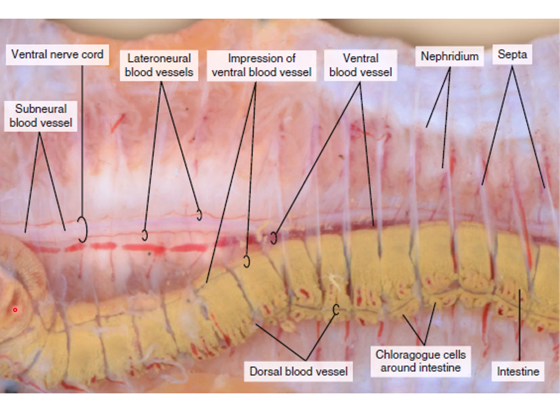The blood from the aortic arches, or the hearts, would enter into the ventral blood vessel, and from there the blood would enter into the capillary bed. Here we can see the capillary bed. The blood circulates in the body, and then comes into the dorsal blood vessel and re-enters the pseudo heart. So the dorsal blood vessel brings blood back towards the pseudo hearts, and the ventral blood vessel takes blood away from the pseudo hearts.